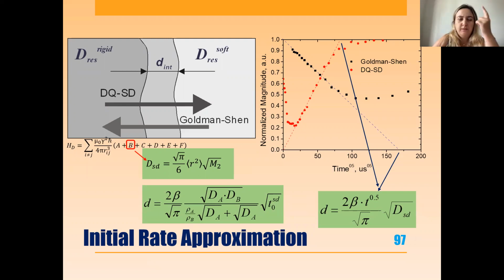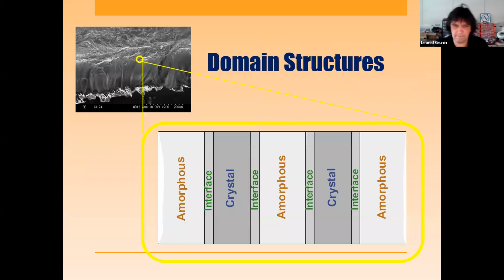But when we do this double quantum, normally we ignore the long component one, right? Yeah, the long component is killed after the double quantum filter. This is what I'm confused about actually. We are killing it, but normally we just don't see it, right? Yeah, there is magnetization over there.